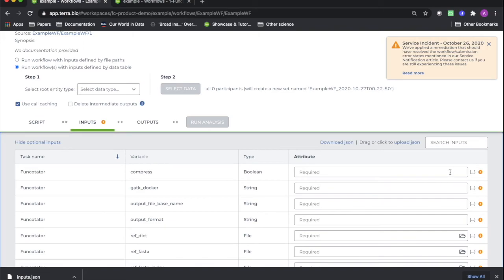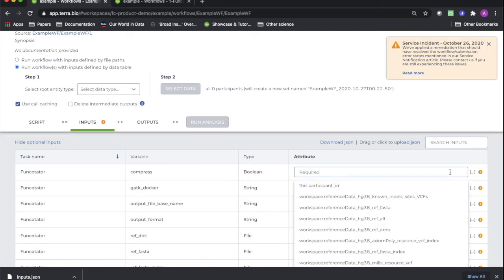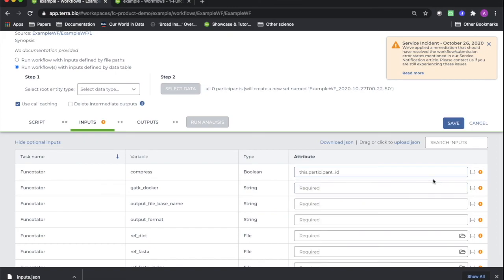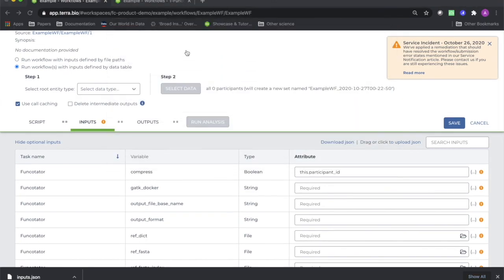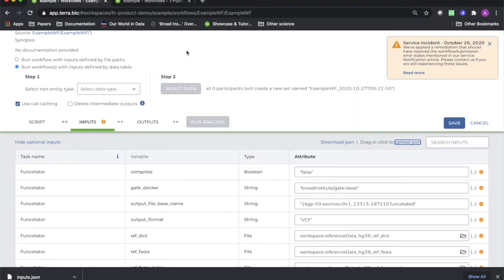You can now fill the fields in manually, or you could upload a JSON file if you have an appropriate one. If I upload the JSON file I downloaded earlier, you'll see the fields are filled in, and your workflow is now fully configured.